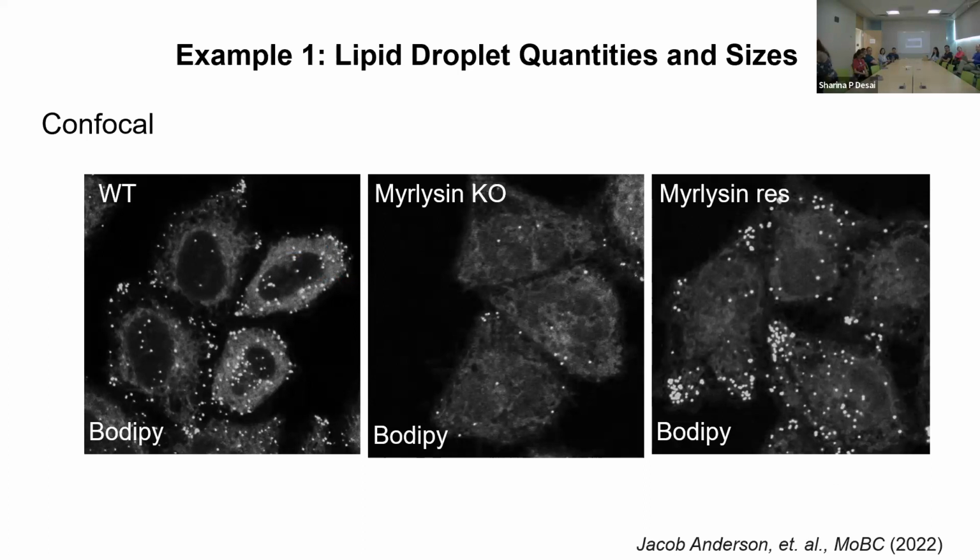I believe most of you, if you use these two pieces of equipment, this will be a very common and maybe popular purpose for everyone. So in our lab, here is an example of an image obtained from the confocal microscope. You can see each image includes 3 or 4 cells. I didn't label the boundary of the cells, but I believe you can see it very clearly.